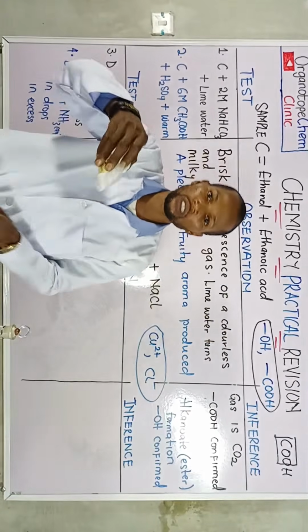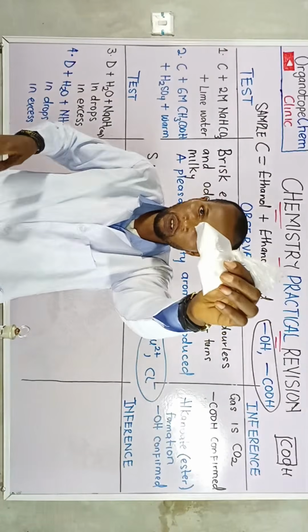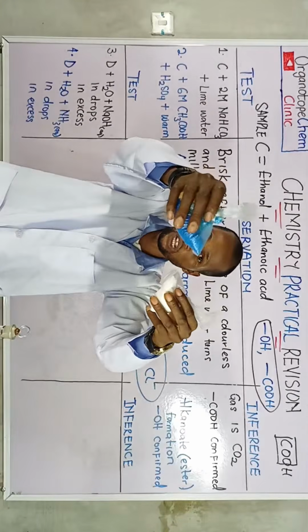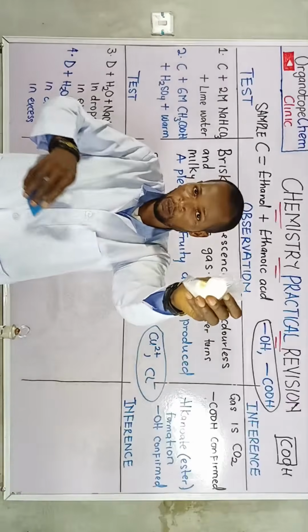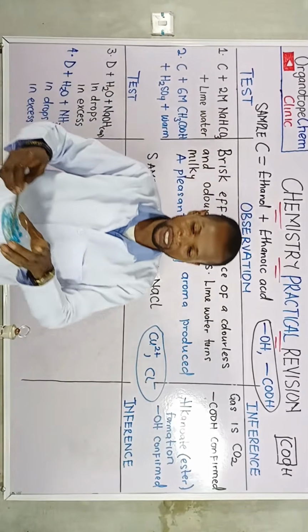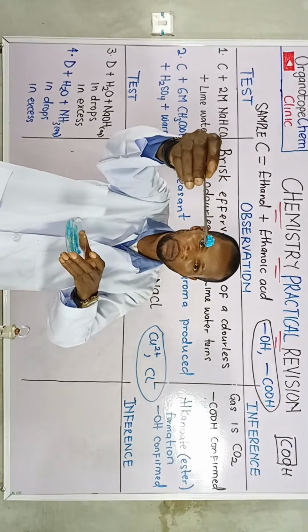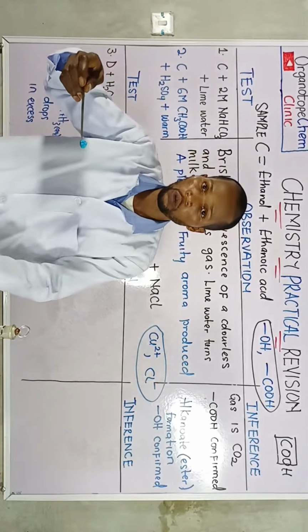And your common table salt, sodium chloride. Can you see the white color? But after mixing, the blue color overwhelmed the white. So you are no longer seeing the white sodium chloride in the mixture. So now we are having this. I assume this to be approximately 1.0 gram of the sample D.